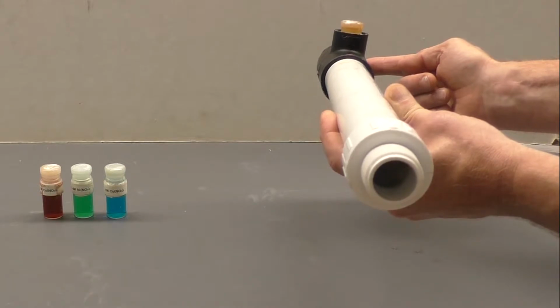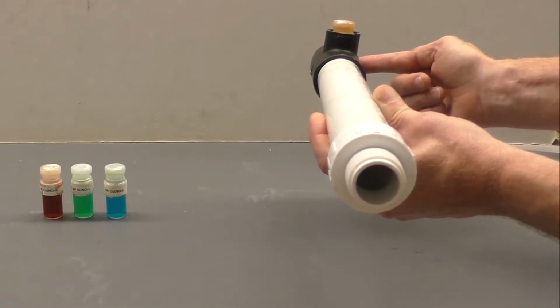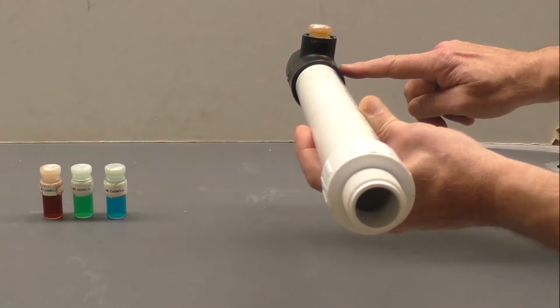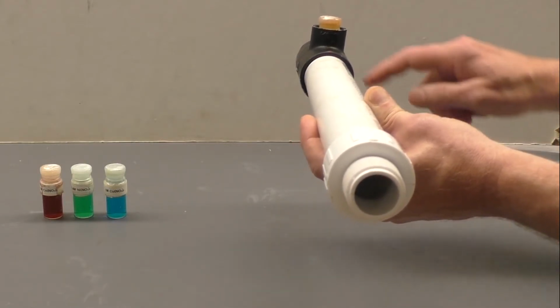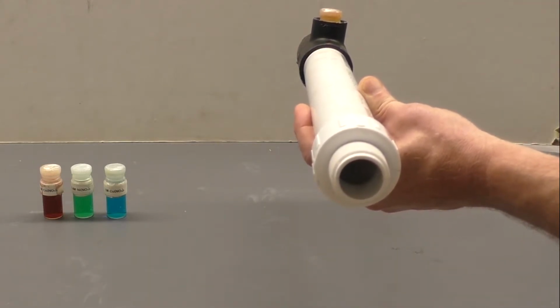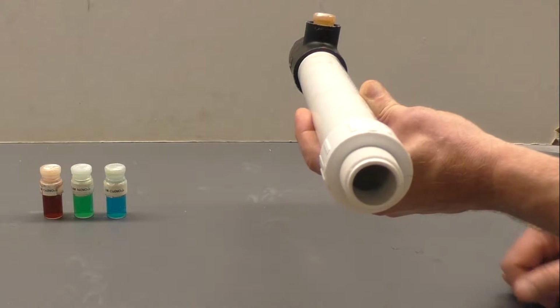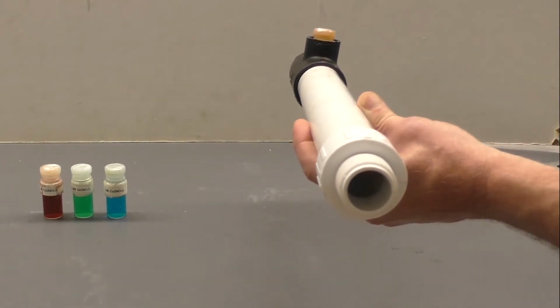You'll see that more clearly in the next part of the video when we actually do the data collection. The idea is that we want the top half of the light coming through the slit to go through the colored solution, and the bottom half is just the regular white light. When you look at it with your eye through the diffraction grating, we'll see what has happened to the light that has passed through the colored solution. For reference, we'll be able to compare that to a full spectrum on the bottom. We in turn look at every different colored solution.